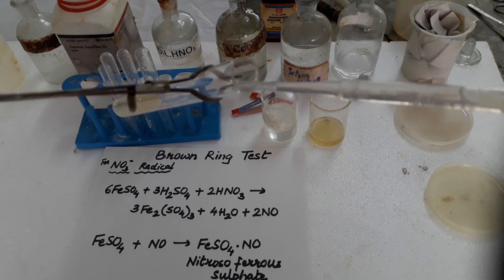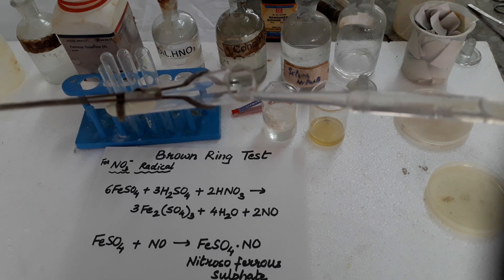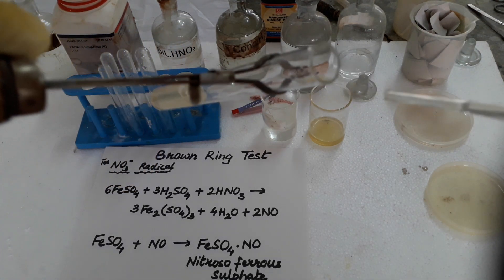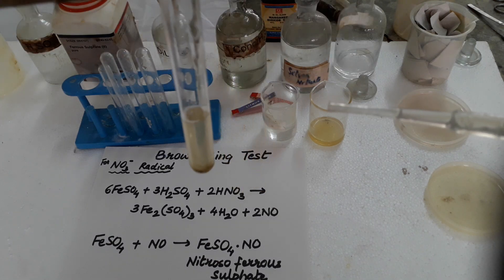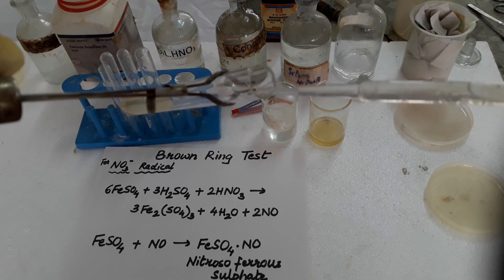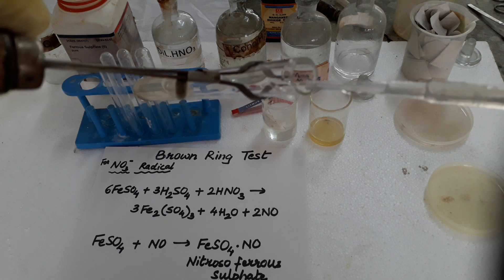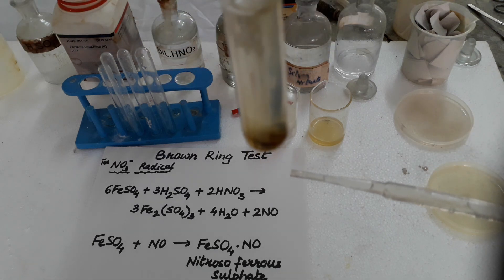This sulfuric acid, being heavier, will move down and will start forming a brown ring at the bottom at the junction of the two liquids. Here you can see it has started forming at the bottom; slowly it will come up. We do not have to add too much concentrated sulfuric acid — 4 to 5 drops we add.